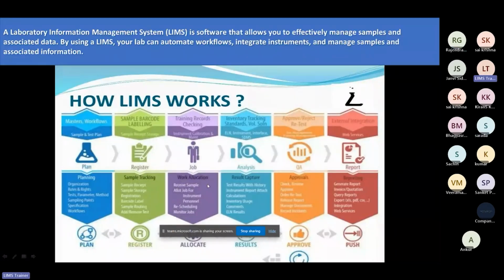Now when he finishes the analysis activity, the result capture happens in the LIMS software. Whatever results are generated, there are many types: calculations are required, or some chromatography is required. All the results generated are collected in the system, and after this it goes to a reviewer.